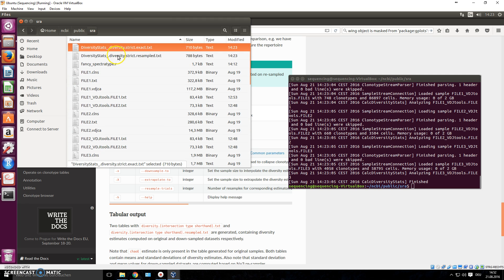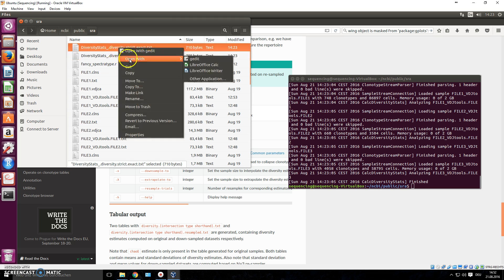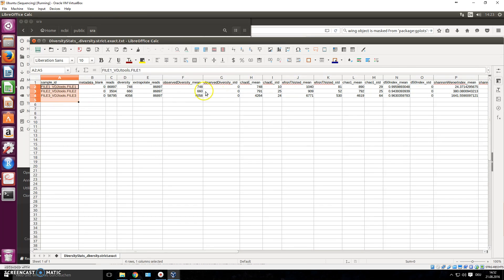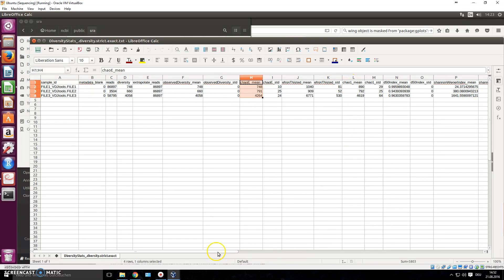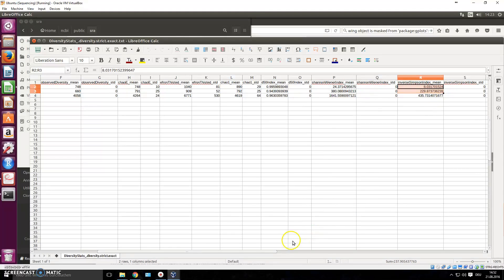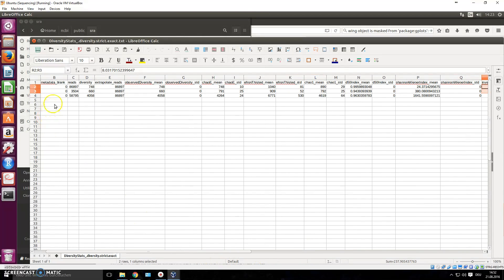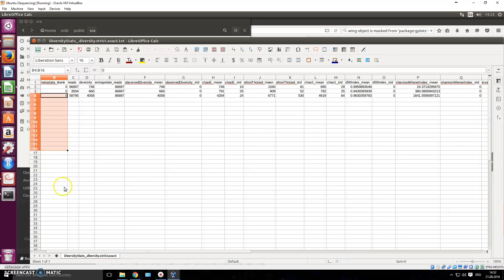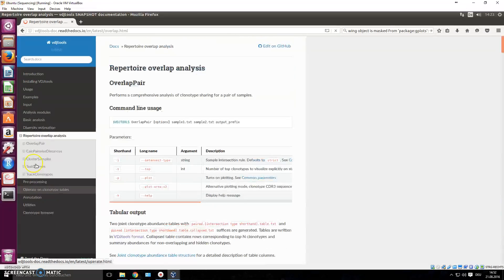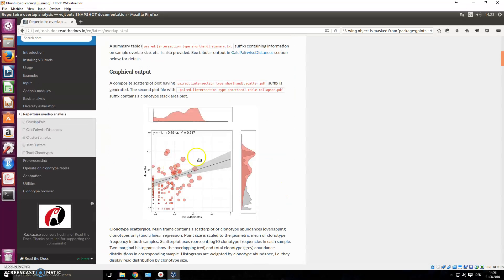There we go — 'diversity stats' files appear in our folder. Opening one, you can see for all three files you have the observed mean, the Chao mean, the Shannon-Weiner index, and the inverse Simpson index. It's a nice table — if you had a whole folder with 100 samples, this would be a great addition to your bioinformatics pipeline.